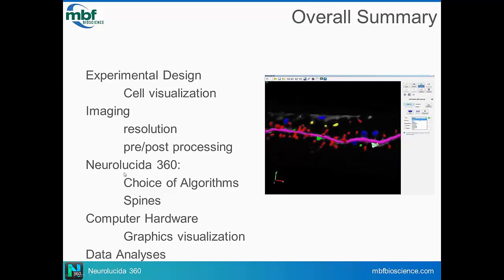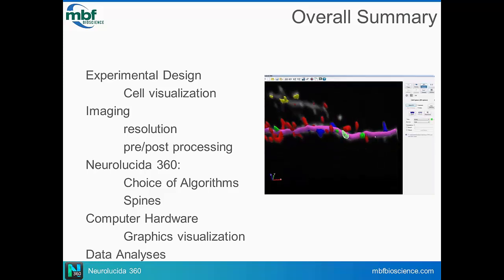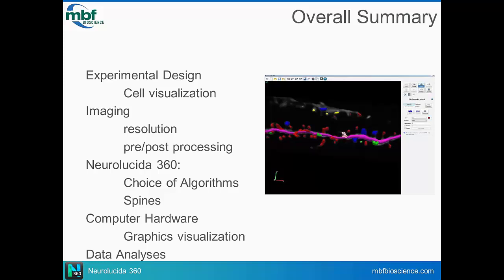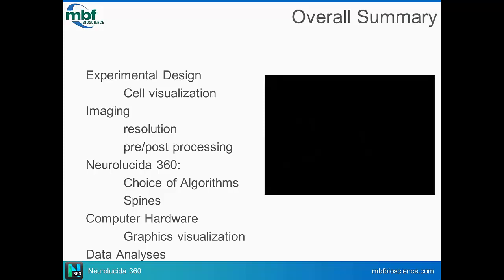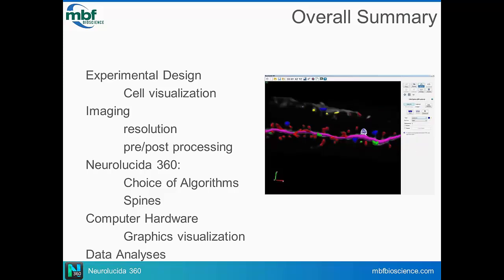And then I introduced you to Neurolucida 360. It is our interactive 3D environment for data collection, and it provides a number of algorithms for manual, interactive, and fully automated tracing of somas, dendrites, and spines, synapses. And it is in active development, and we are very much enjoying all of the fun research that we can do to improve the visualization, to expand to bigger and bigger and bigger image data sizes. So working with CLARITY data sets that are terabytes in size, it's pretty fascinating.